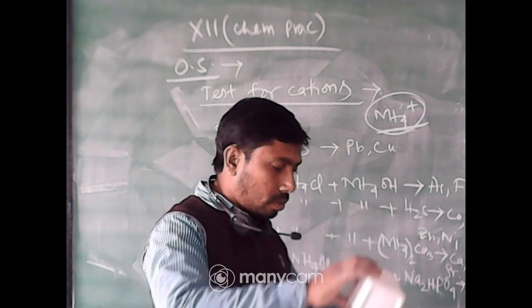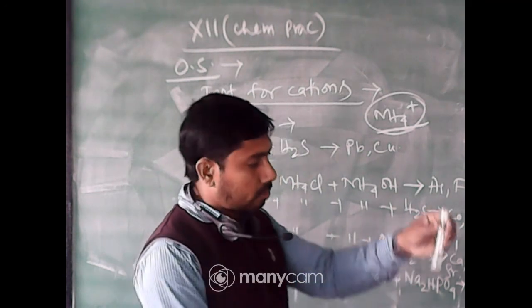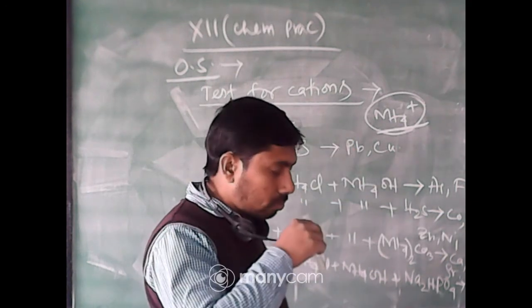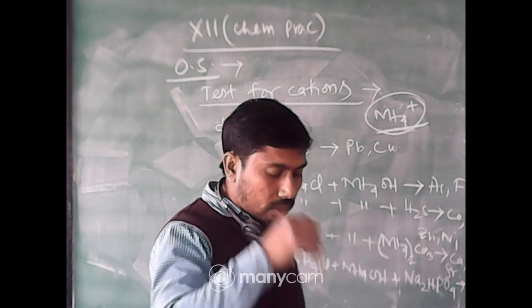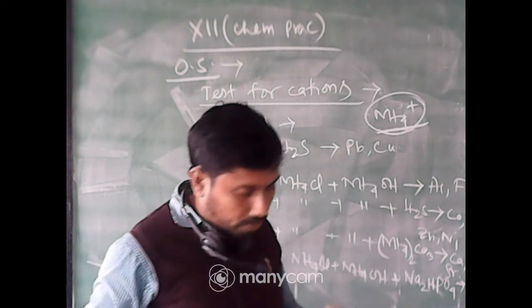Okay. So, adding sodium hydroxide to that solution, no change till now, but a smell of ammonia is coming out from the test tube.